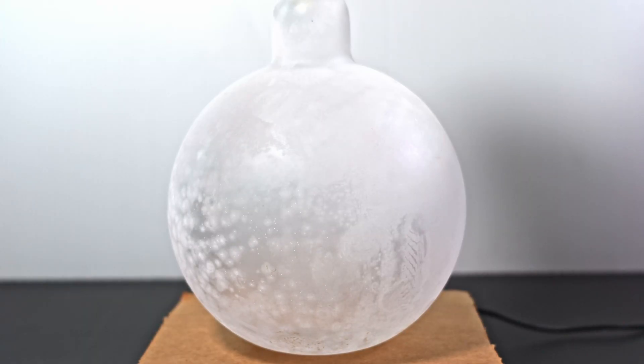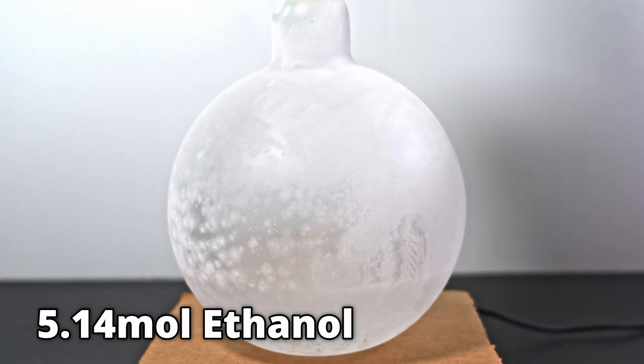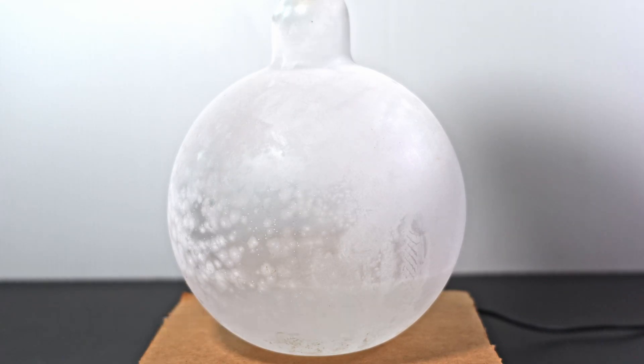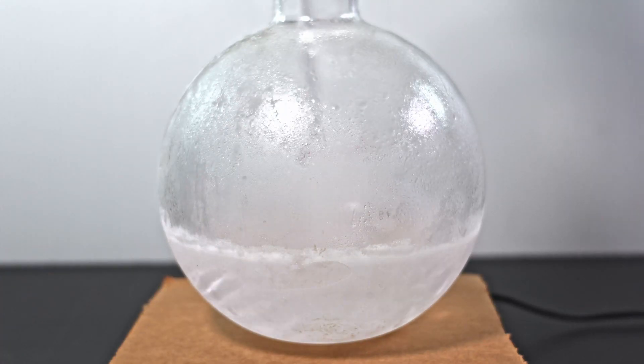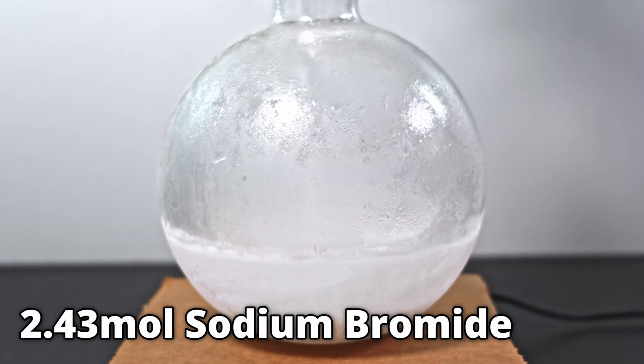In a chilled flask, I pour in 300 milliliters of freezing ethanol. This is approximately 5.14 moles of ethanol. I stir it on high as I add in 250 grams of sodium bromide. This is approximately 2.43 moles of sodium bromide.